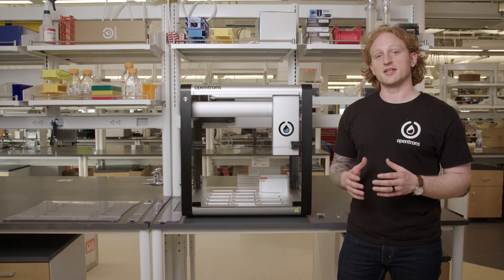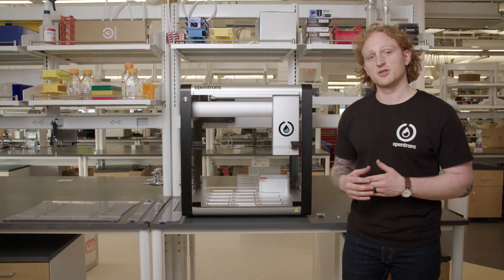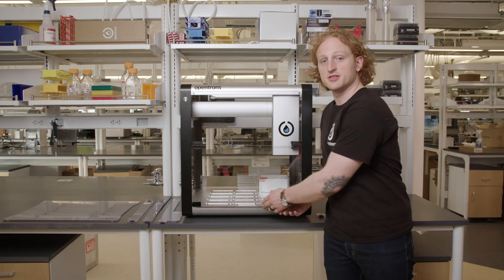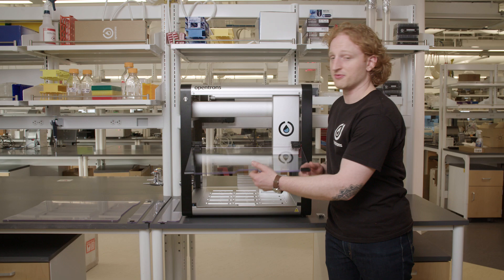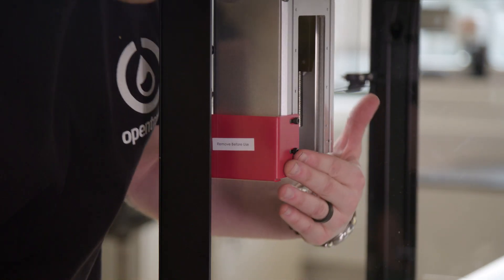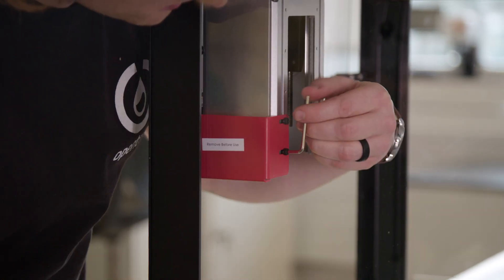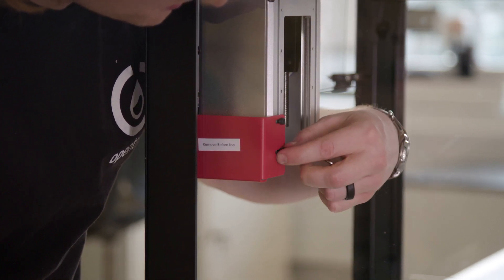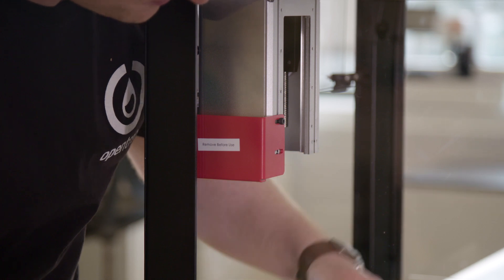The first bracket is held on by four screws, two of which are found behind the pipette carriage. These screws can be accessed via the front door. I will use the 3mm hex screw to remove these screws. Make sure to collect the nuts that fall out of the carriage.